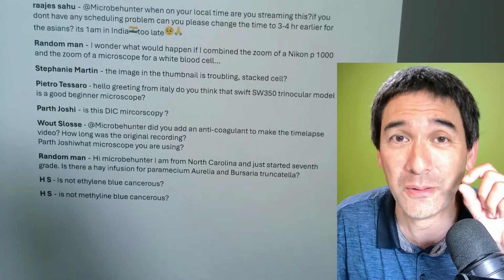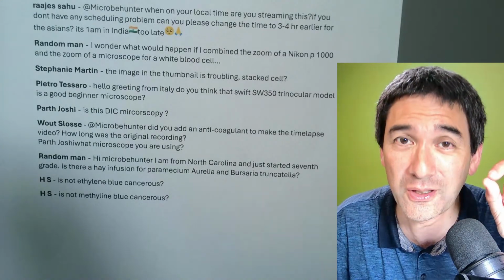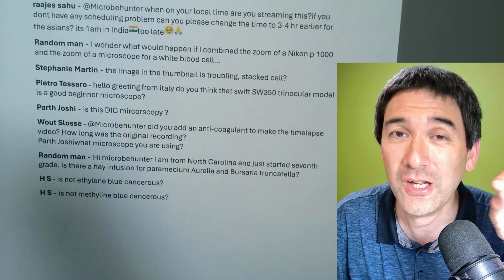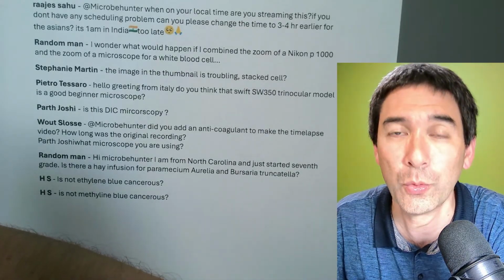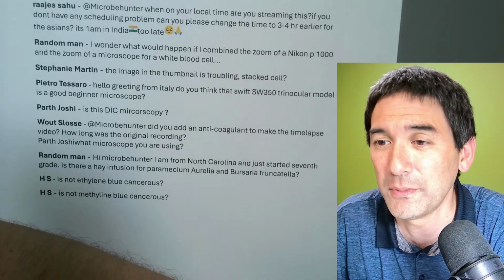The thickness of the blood layer beneath the cover glass, whether I look at the periphery of the cover glass or in the center, because on the sides it starts to dry out faster. So it always looks different, but it's not because of the blood so much. It's more about the preparation. Yeah. So that's simply the thing here.